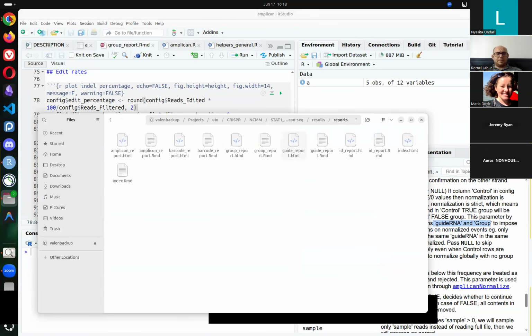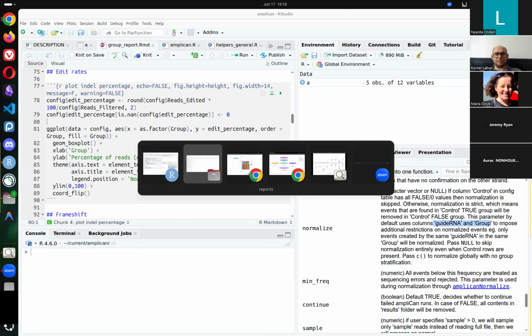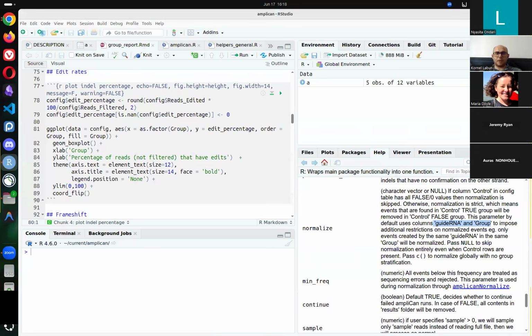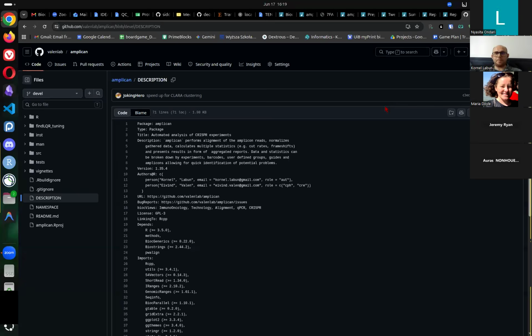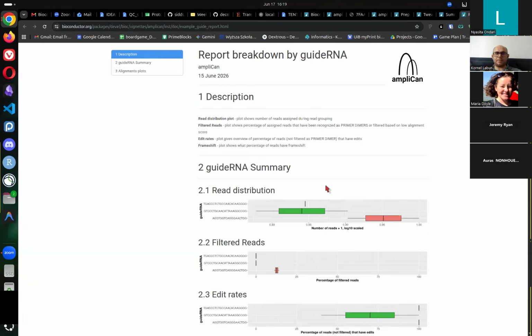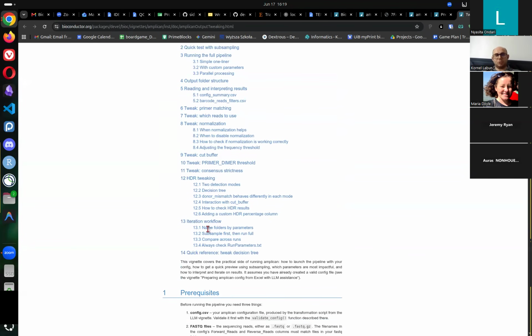So this is the main story, and I haven't even started with how to use these LLMs to make the configs for you. So we can close this. I think you can look it up yourself if you are interested, because now I have published these vignettes. One is about tweaking the outputs, and here you've got a strategy for how to do it.